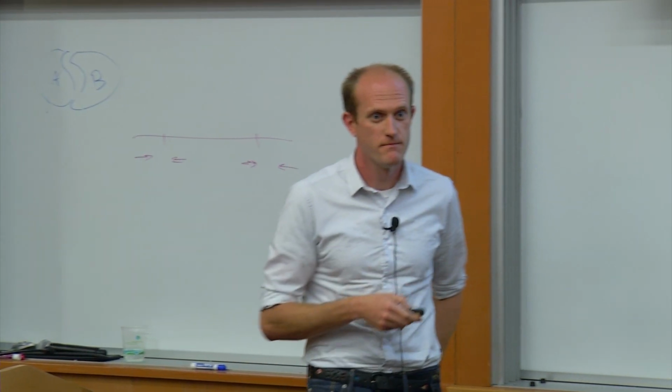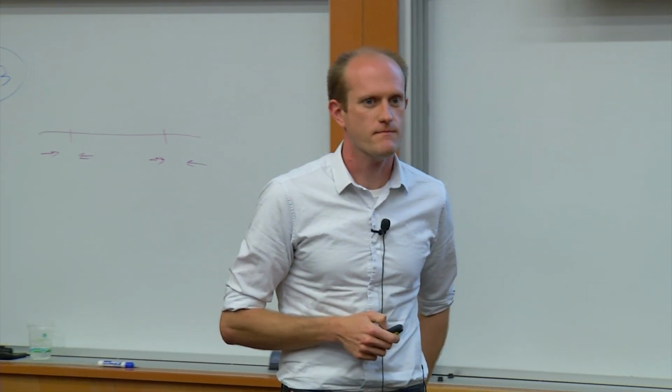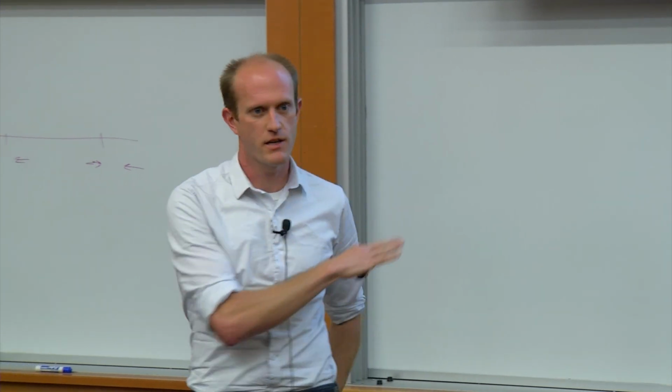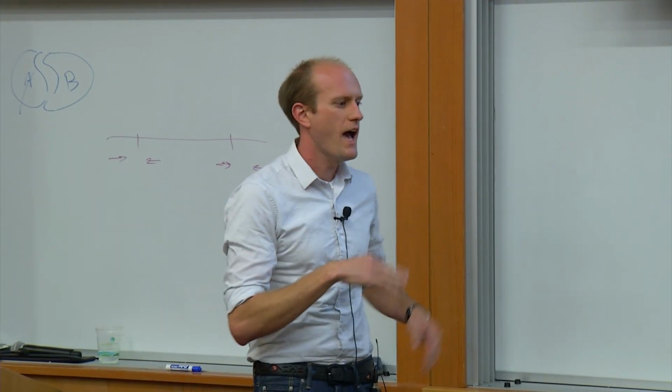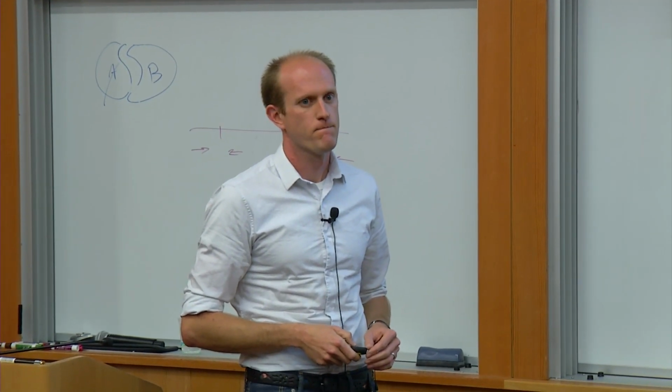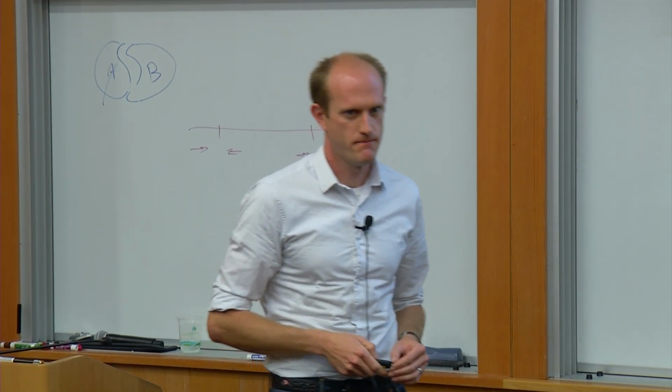Okay? Yep. This is for off-targeting as opposed to on-targeting. That's correct. So this tells you nothing about on-targeting. So this would tell you how likely am I to hit some other position. And those values are static at those positions. Correct. That's right.